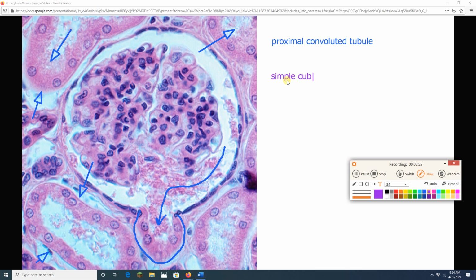There are going to be a lot of microvilli in this epithelial lining on the apical surface. So in fact, all the pinkish junkiness in here is because of the microvilli. Microvilli give us more surface area, more surface area to reabsorb good stuff from the filtrate and also to secrete bad stuff into the filtrate. So we can reabsorb stuff we want to keep in the body and secrete stuff we want to get rid of, we want to pee away.